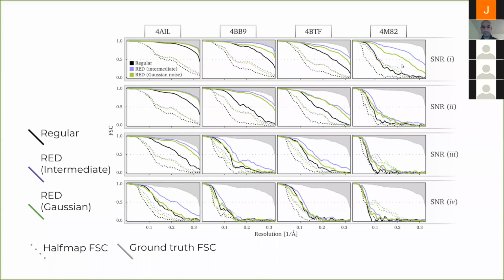So basically, Gaussian distorted images are not able to teach the denoiser all the different artifacts that you actually encounter in reconstruction. And obviously using Relion intermediates is better. And you can actually see that in the results here. And this gray area here is basically how good you can get. This is when you reconstruct using the known angles.